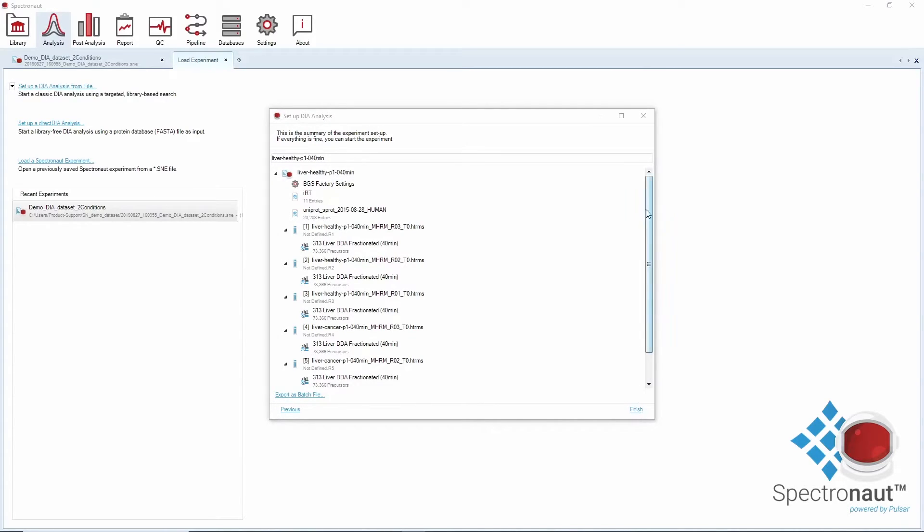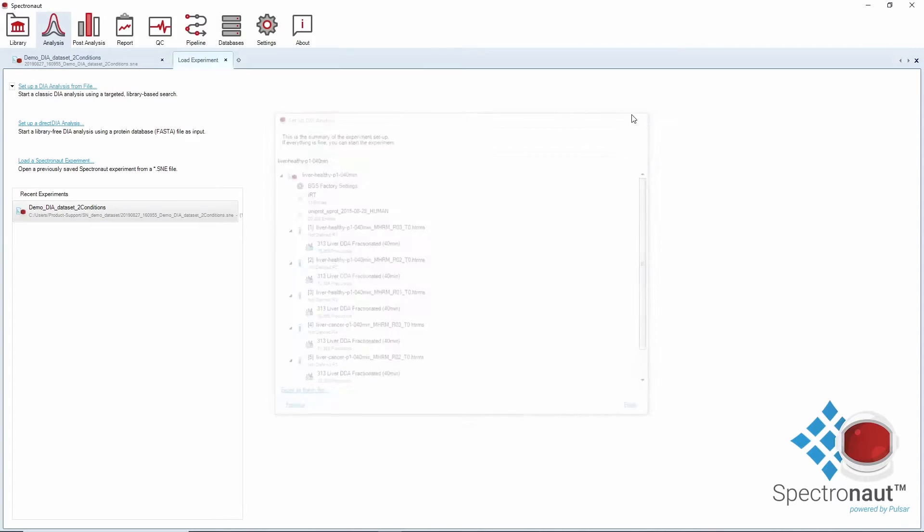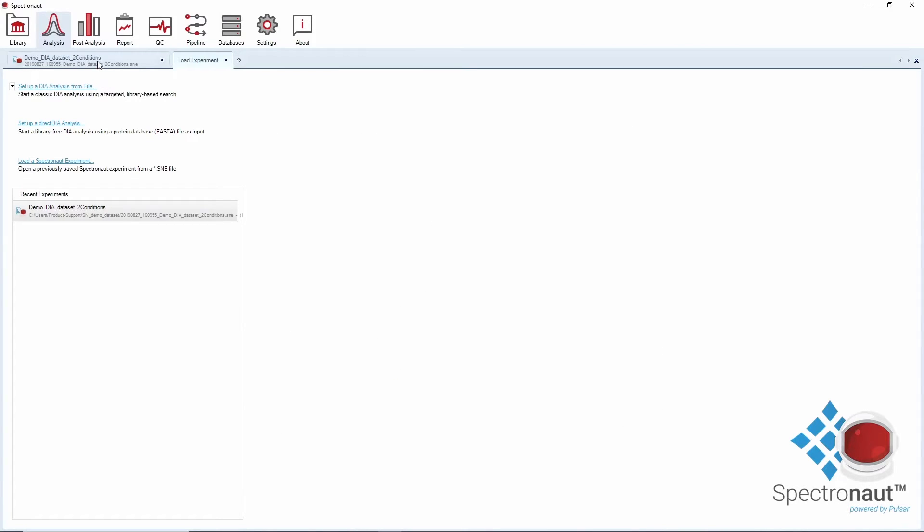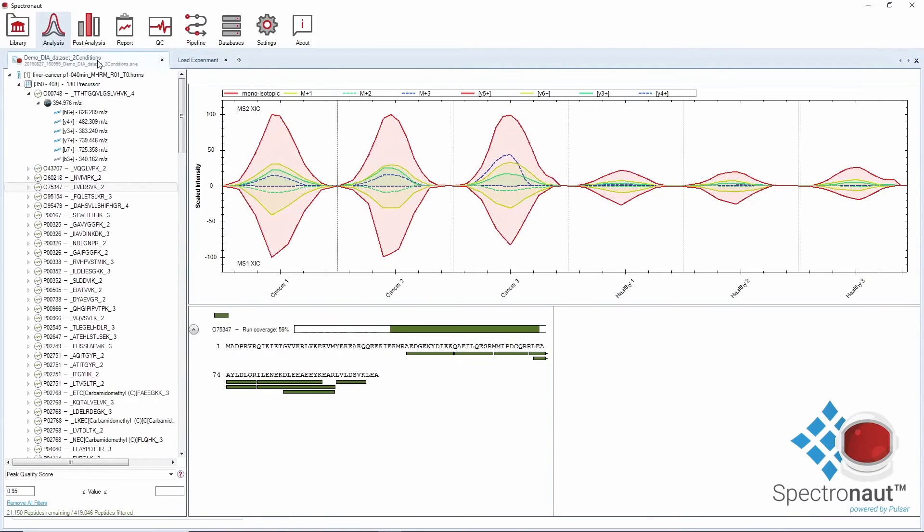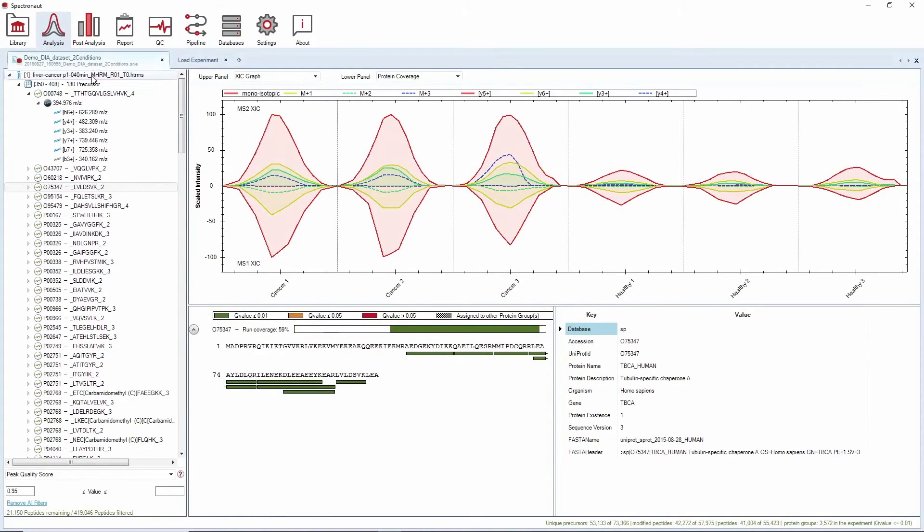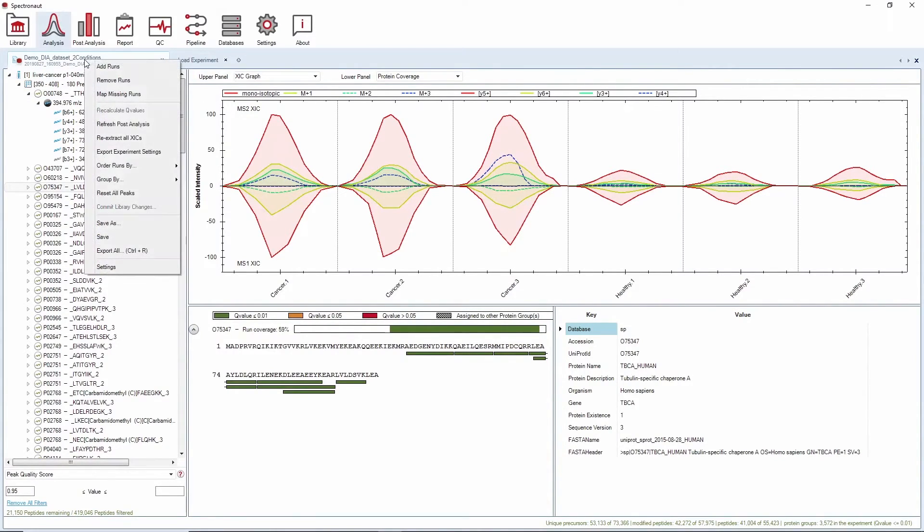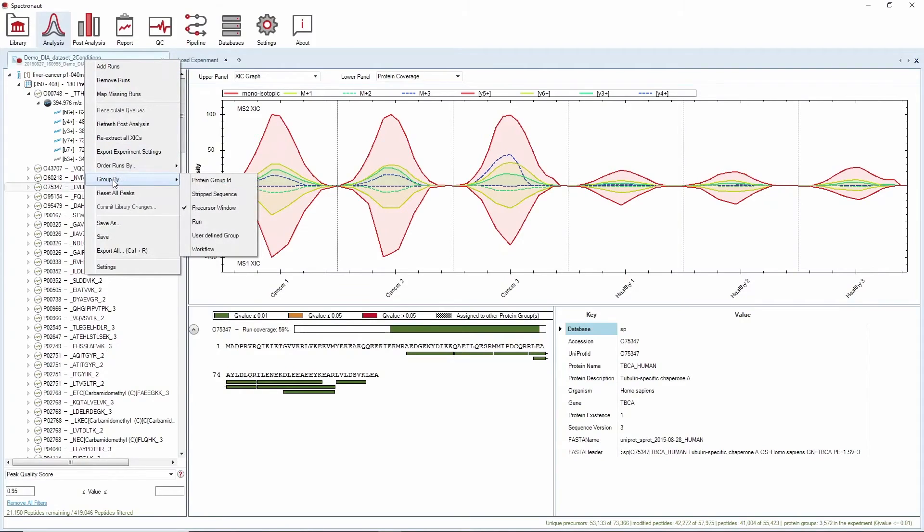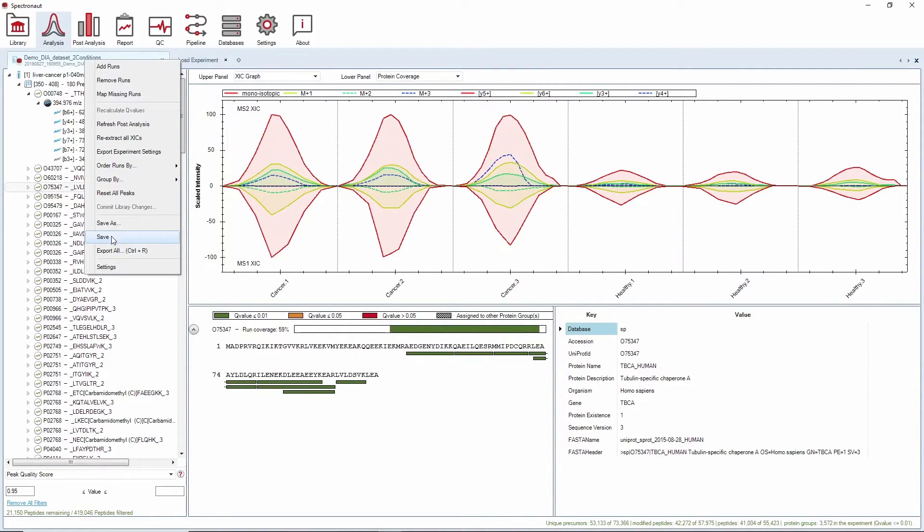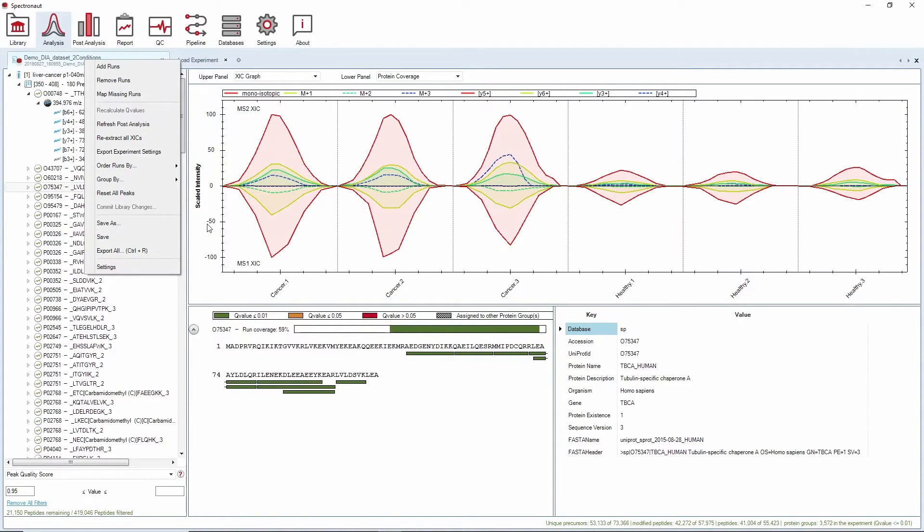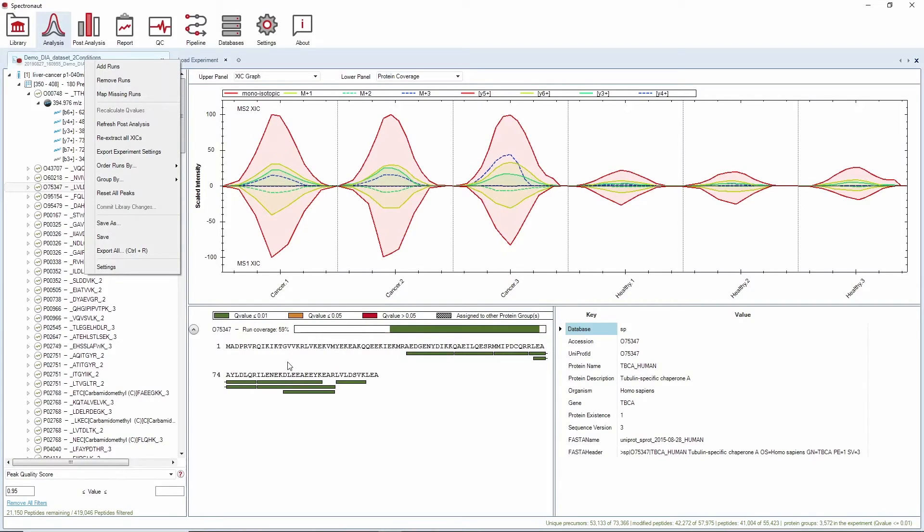You can revise your analysis in the analysis perspective. By default, your runs will be organized by isolation window, precursor and fragment ions. By right-clicking on the experiment tab, you can group your runs differently as well as save your experiment. Here, you also have different plotting options. The XIC graph, for example, shows you the MS1 and MS2 intensities across runs. The protein coverage shows the position of a precursor in the protein sequence and the confidence of the assignment.